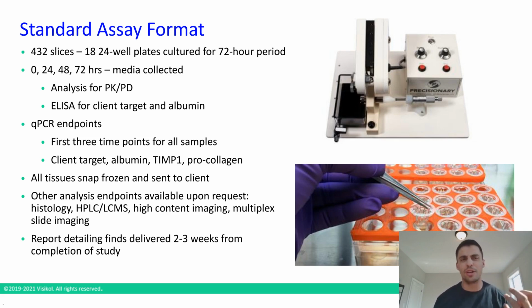But this is a really unique assay because we're taking the native tissue architecture, we're taking the native tissue itself and using it as an in vitro model. So you're working with real human tissue and keeping it in a culture.